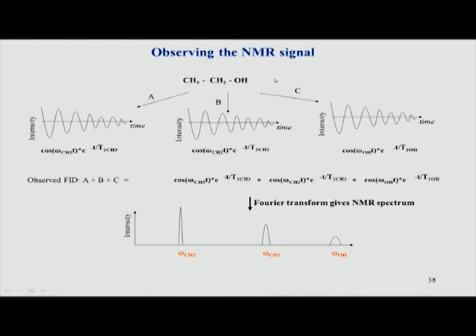The area of the peak of methanol, which is also in the same sample, will be proportional to its concentration. Therefore, by directly comparing the peak areas in NMR, we can find out the concentration, provided we have a reference concentration, which we will see later.